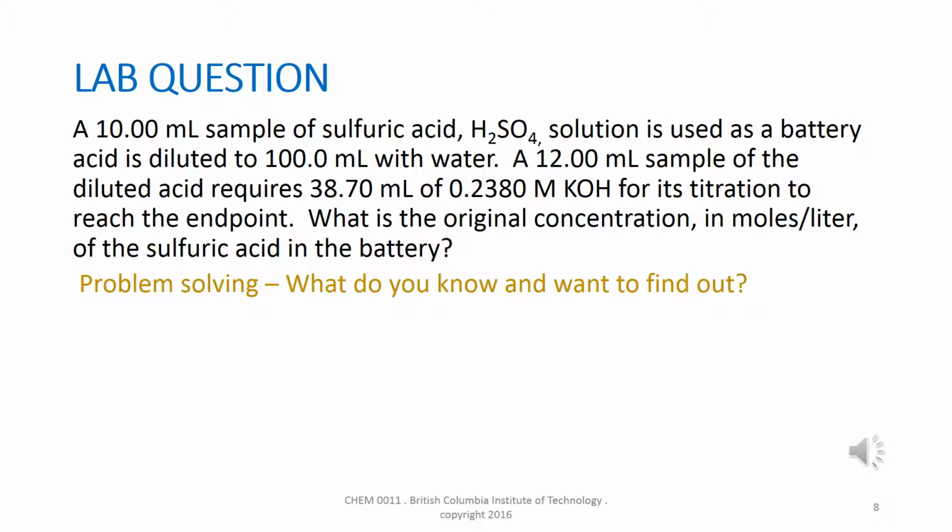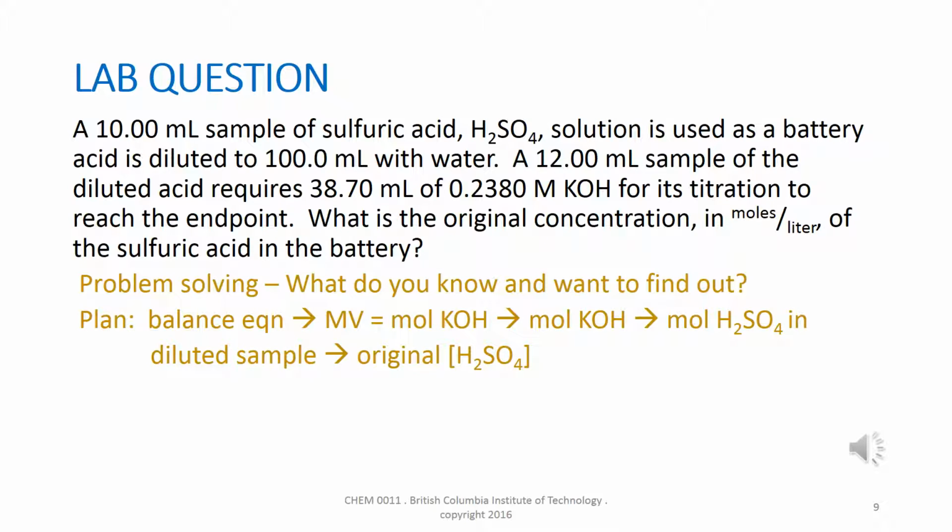The lab question is based on an acid-base reaction as well. Use a plan to relate the different values needed to solve the problem. The plan used to solve the problem relates the balanced equation and given quantities to calculate the original sulfuric acid concentration.